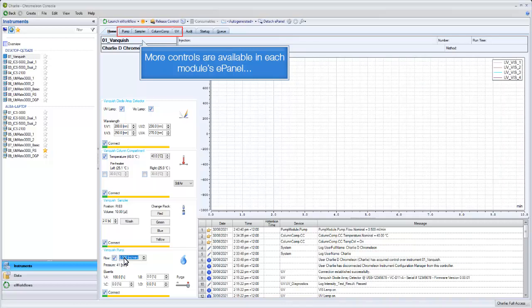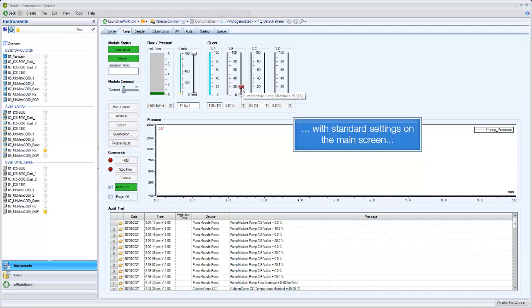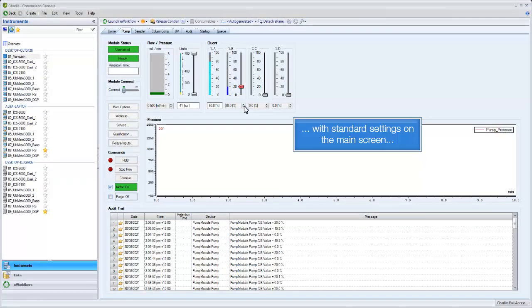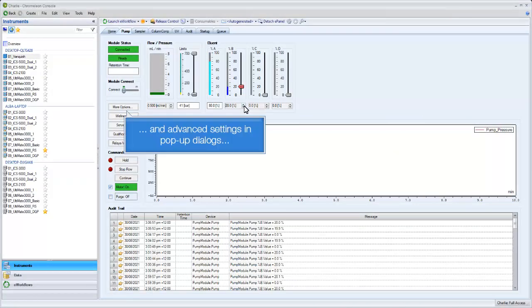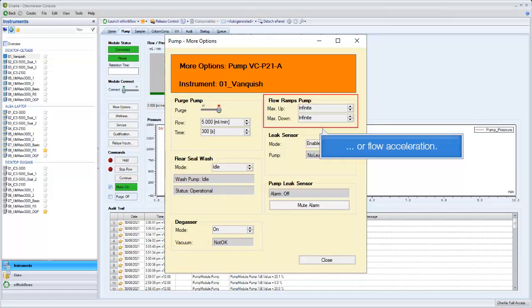More controls are available in each module's panel, with standard settings on the main screen and advanced settings in pop-up dialogs, such as the purge settings or flow acceleration.